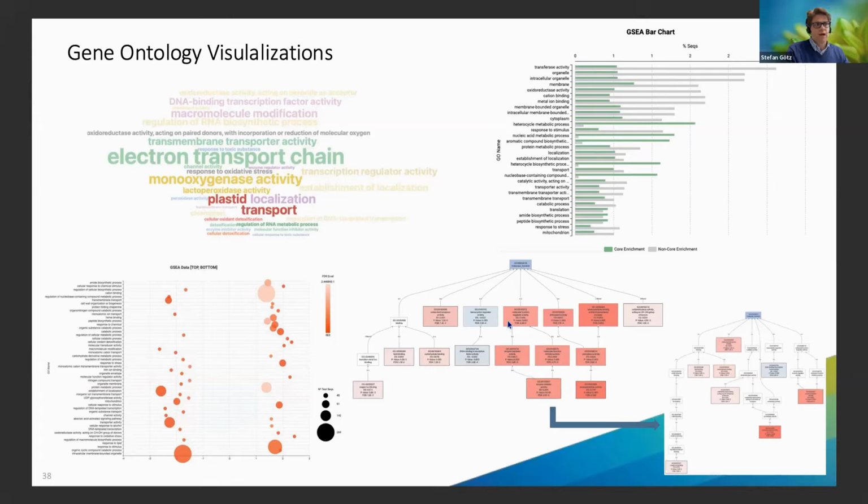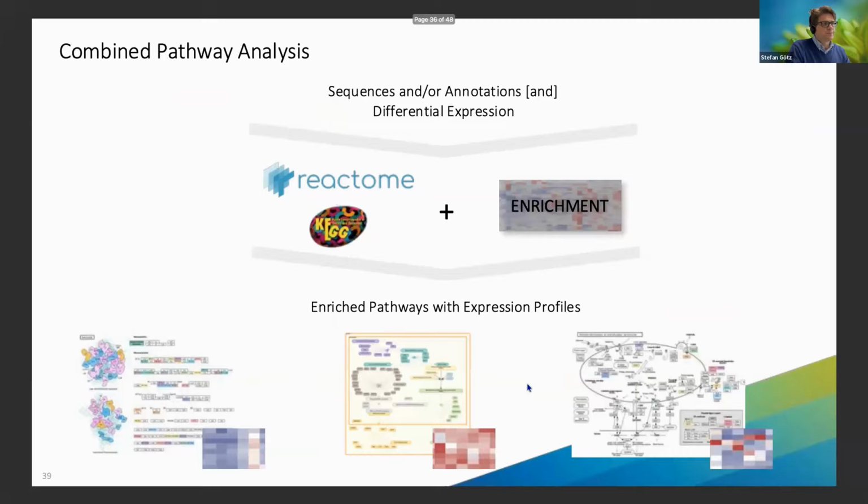And you have your charts where you can see how certain enriched and statistically significant functions relate to each other, because often they have a parent-child relationship. So if you have a long list of functions, you can prune those, remove those, so you stick to only the most specific enriched functions, which helps a lot with the interpretation step as well.